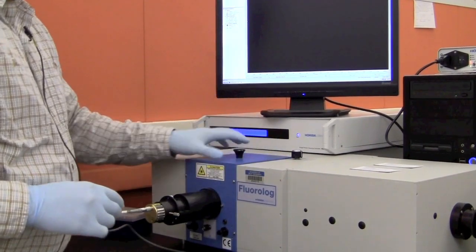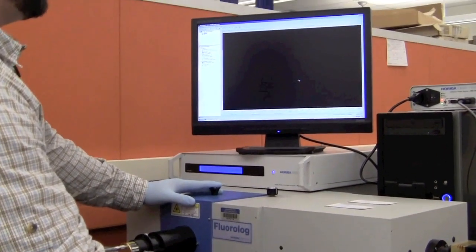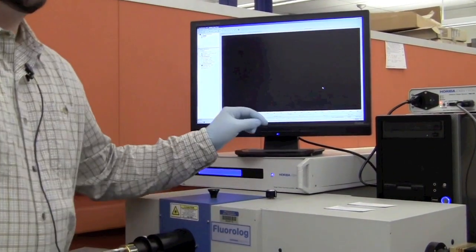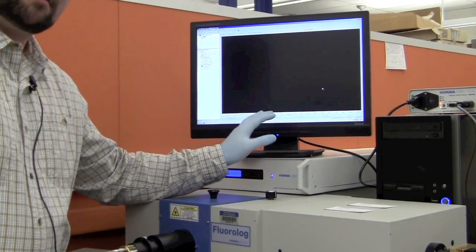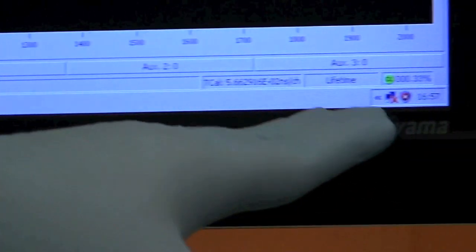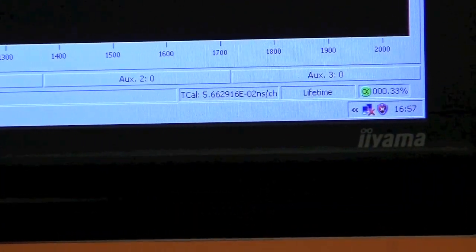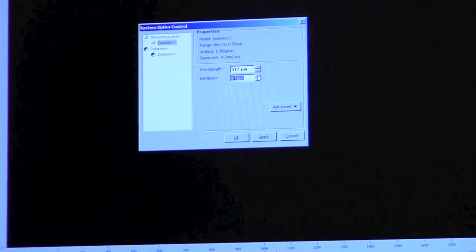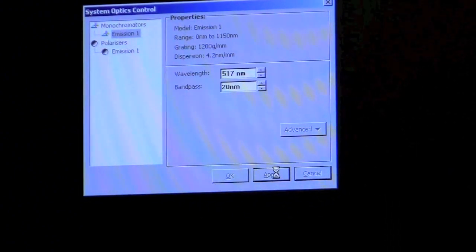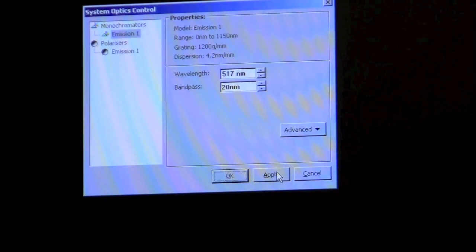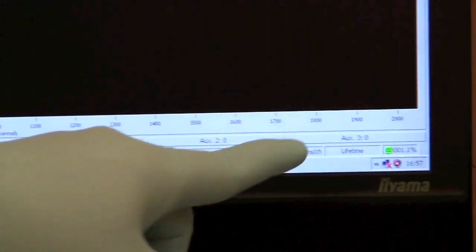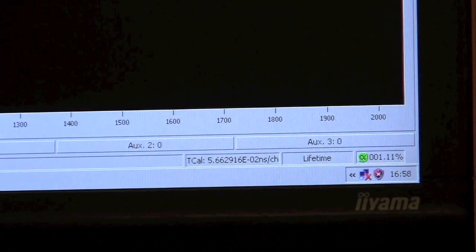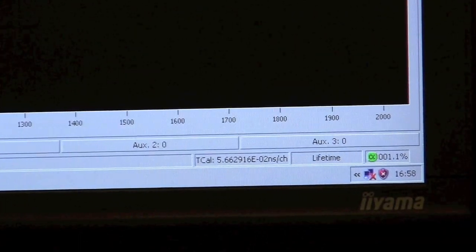Once we place our solution in the instrument, we want to make sure we're not collecting too many photons. We want to stay within about 0.5 to 2% photon collecting, which you see in the lower right-hand corner. We're at 0.34% now, so we need to get that higher. I'm going to open the slit widths all the way to 20 nanometers. Now we're collecting 1.1%. Once we go over 2%, this green icon will turn red, and you'll know to close your slit widths.